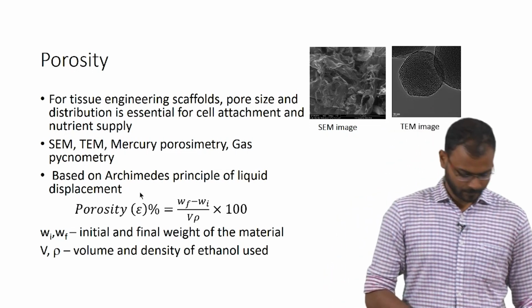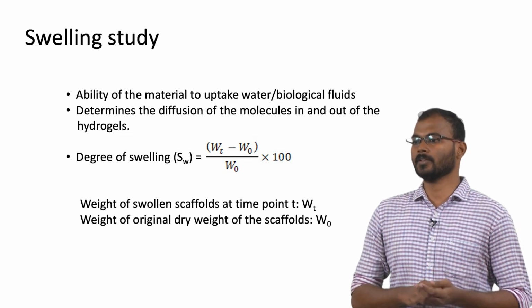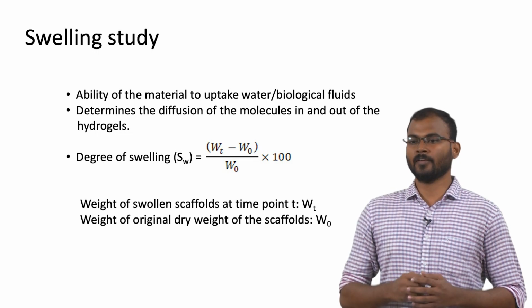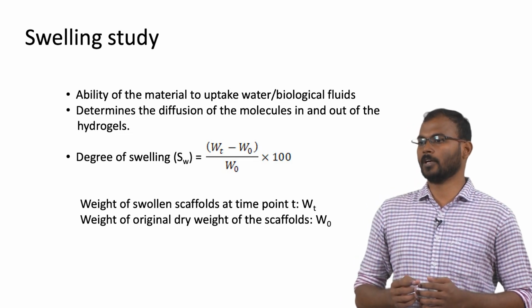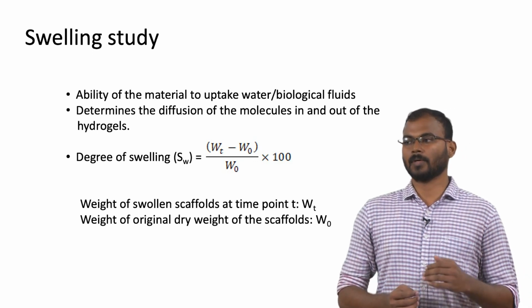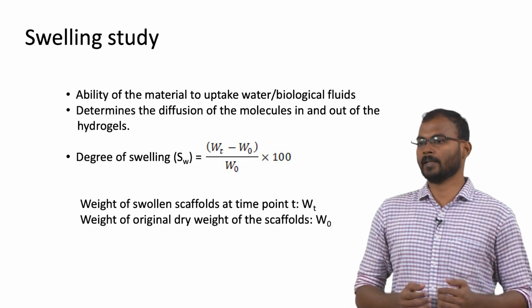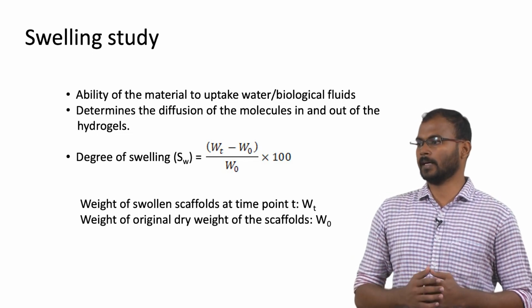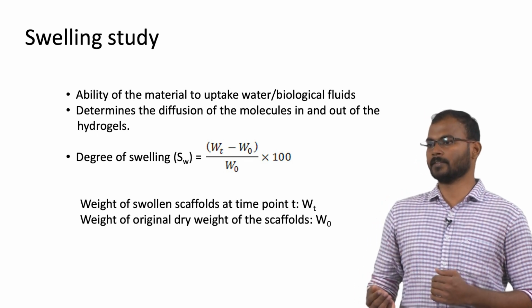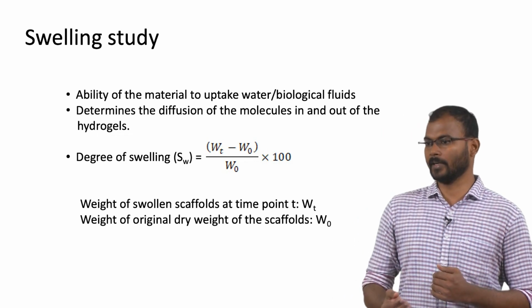Okay. Swelling study is predominantly used for hydrogels because the uptake of water majorly influences the kinetics of molecule loading and release from the gels. A material which can swell faster means that the water intake is higher, so the nutrients or any other drugs or molecules which you are incorporating into the hydrogel can be released faster.